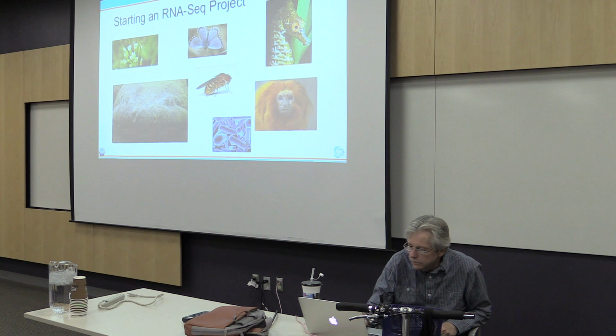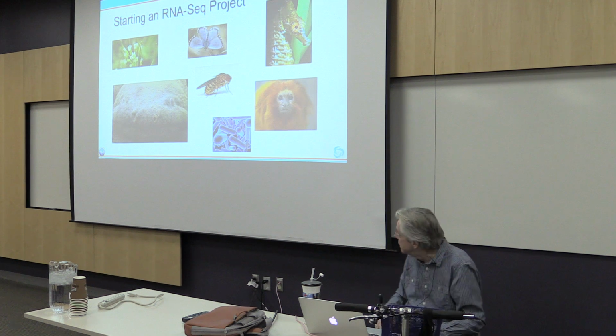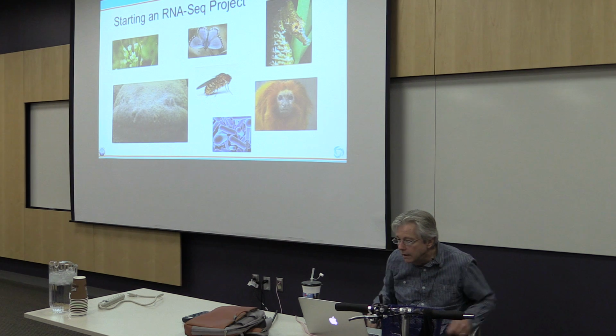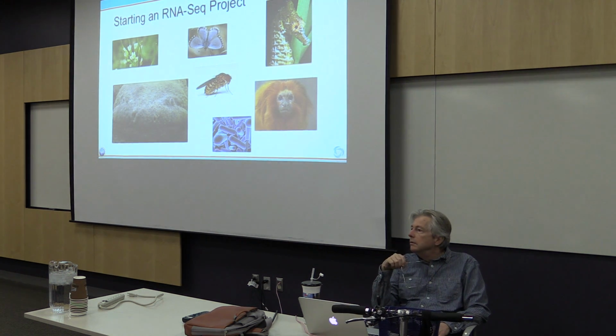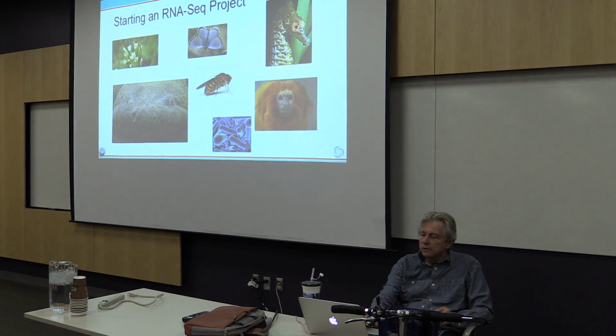So again, when we're starting an RNA-seq project, you start with our organism, whatever it is, and a lot of the time you may be starting with Arabidopsis up there in the far left-hand upper corner, or you may be studying something more exotic and new, and something that nobody else has sequenced before. And so your problems can be different, technically, in what you're dealing with.